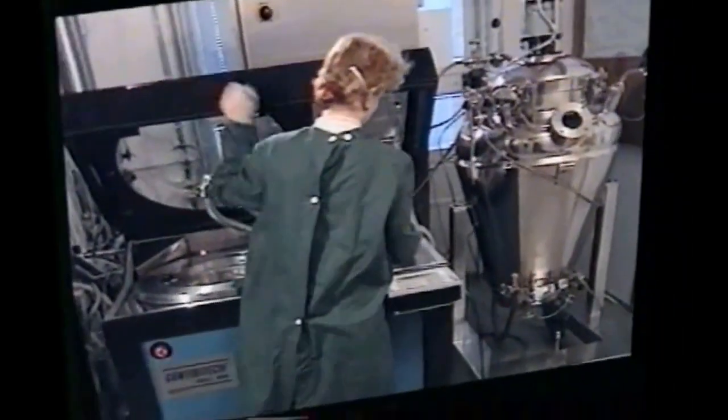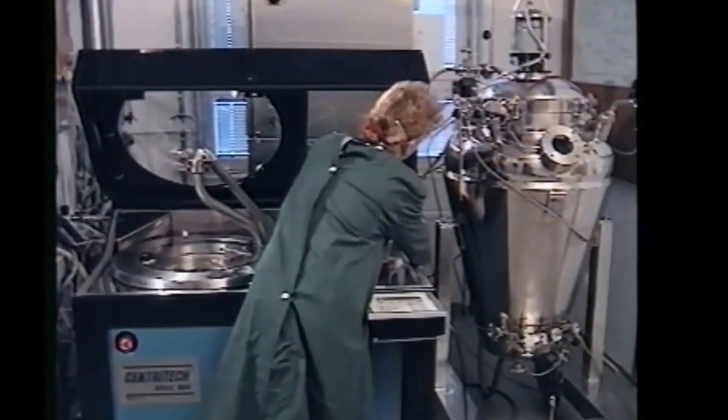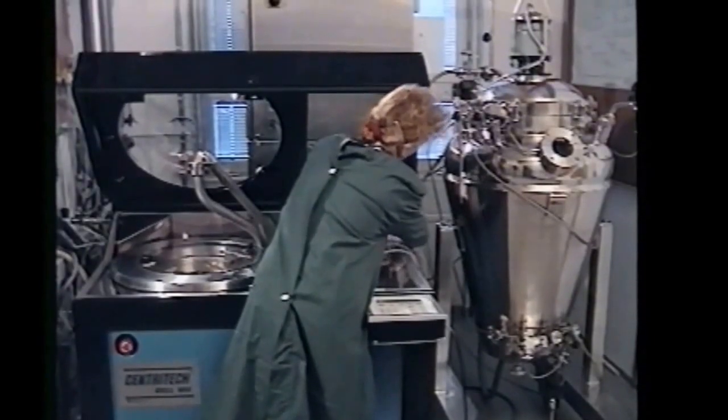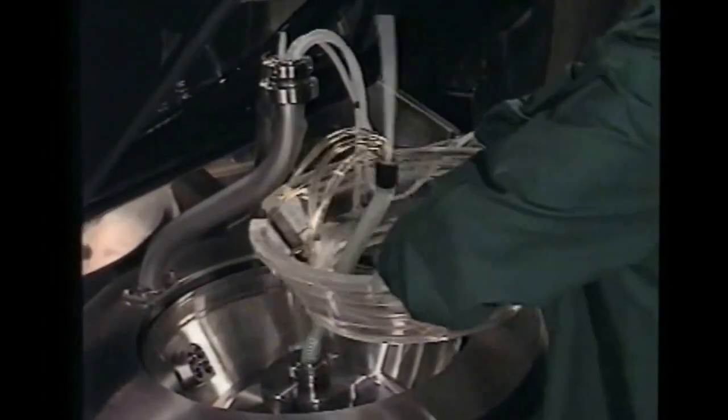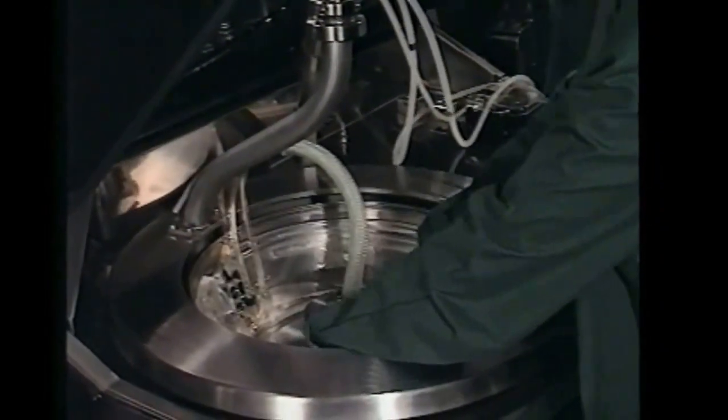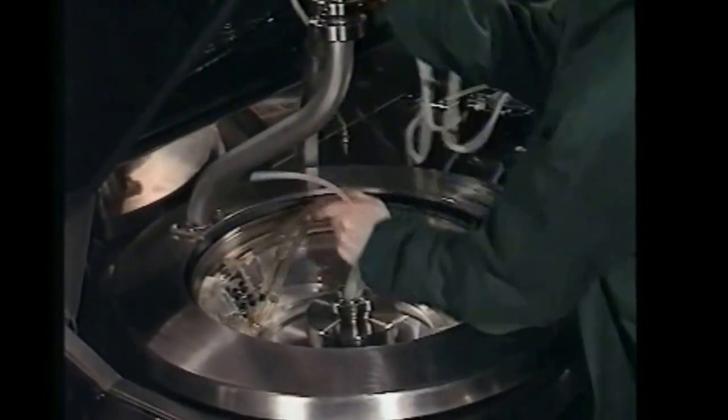When the separation process is complete, then the whole bladder and tube assembly can be removed and disposed of and a new assembly fitted. The process is then ready to start again, the whole turnaround taking only a few minutes.